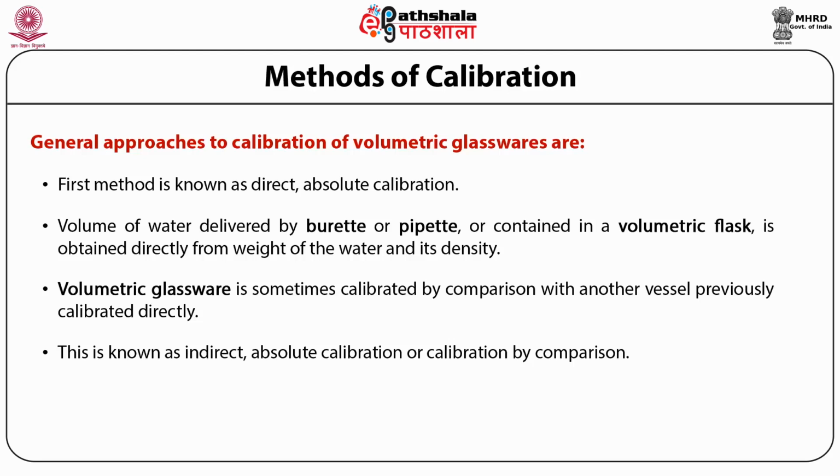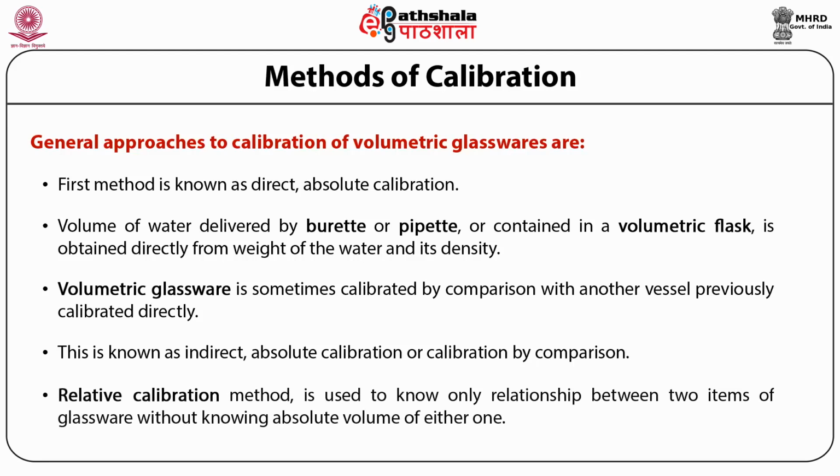Calibrating bulbs are not available in many student laboratories, and specific directions for their use are not included in this lecture. They are not difficult to use if proper care is taken. Students, you may obtain directions for the use of this type of bulb from your laboratory technician or supervisor.